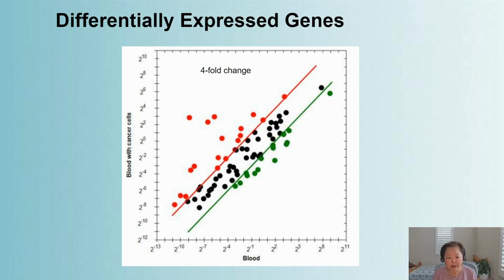We had 3 reference genes to normalize RNA variation between the 2 samples. The scatter plot identified the upregulated genes in red, the downregulated genes in green, and the equivalently expressed genes in black with a 4-fold cutoff.